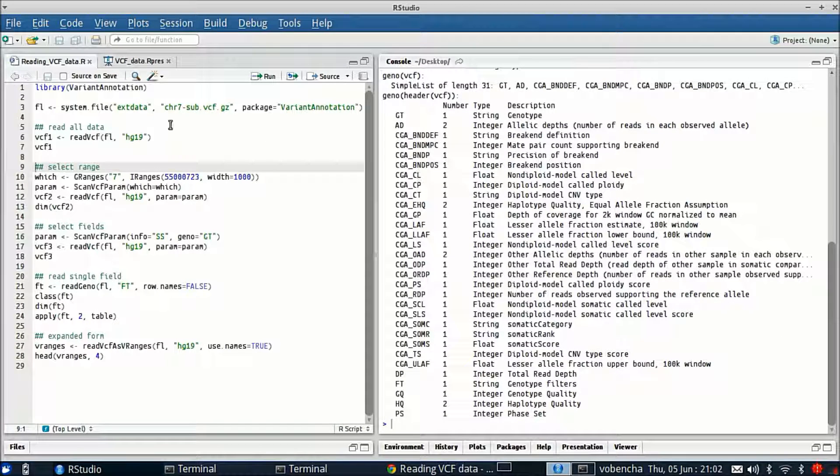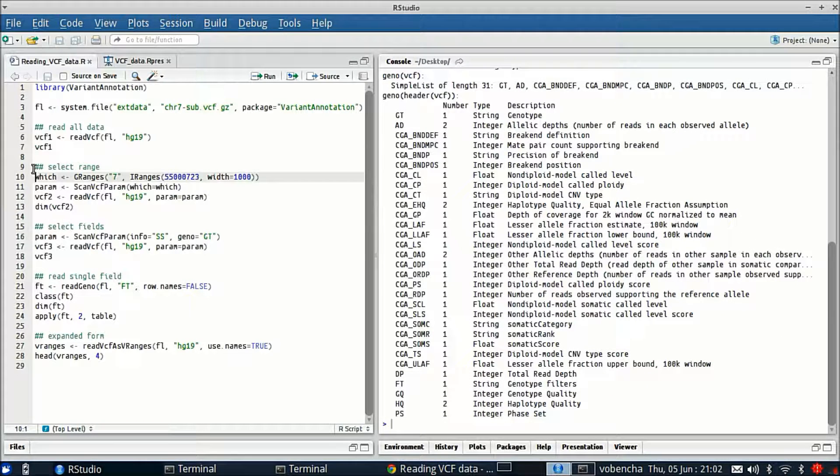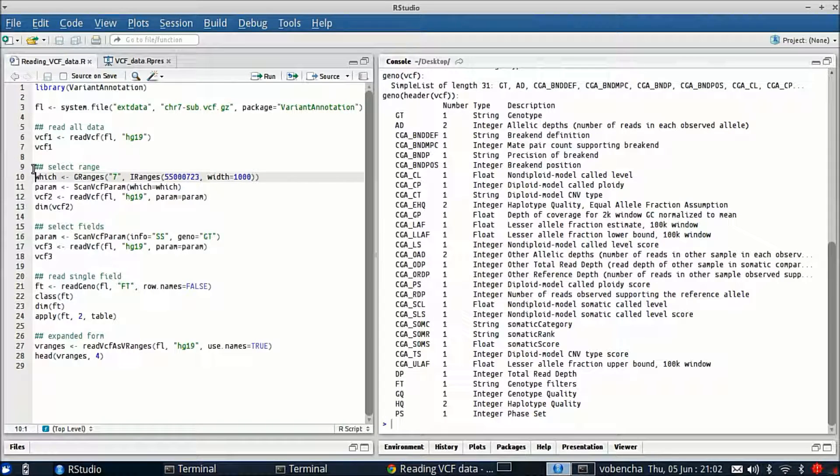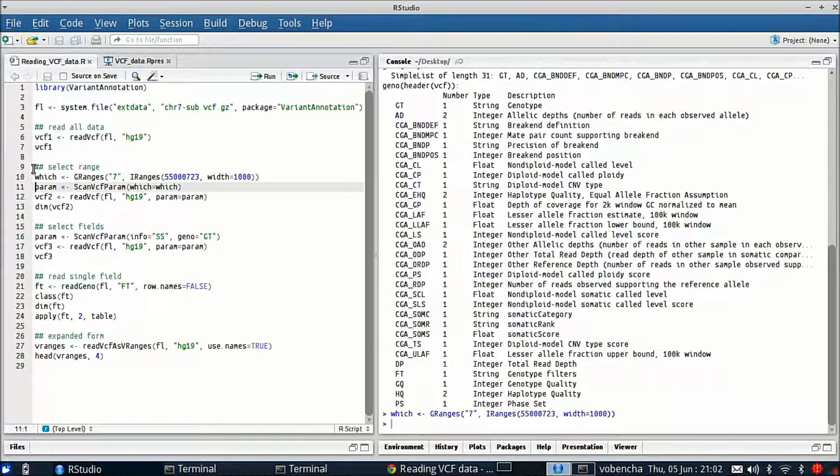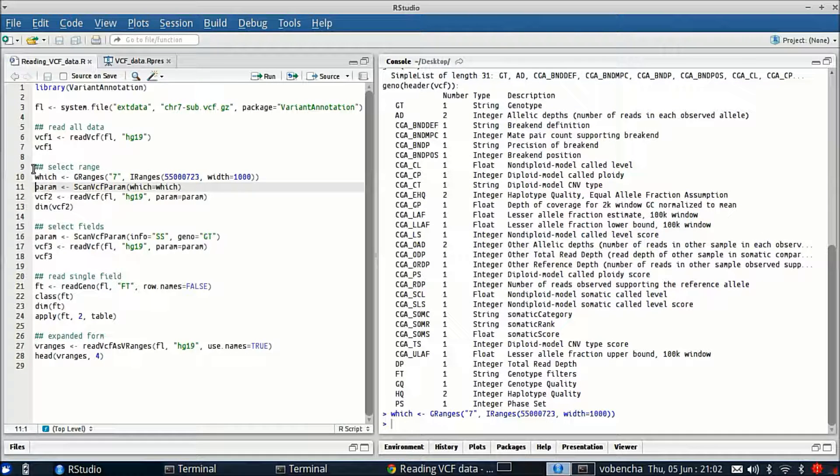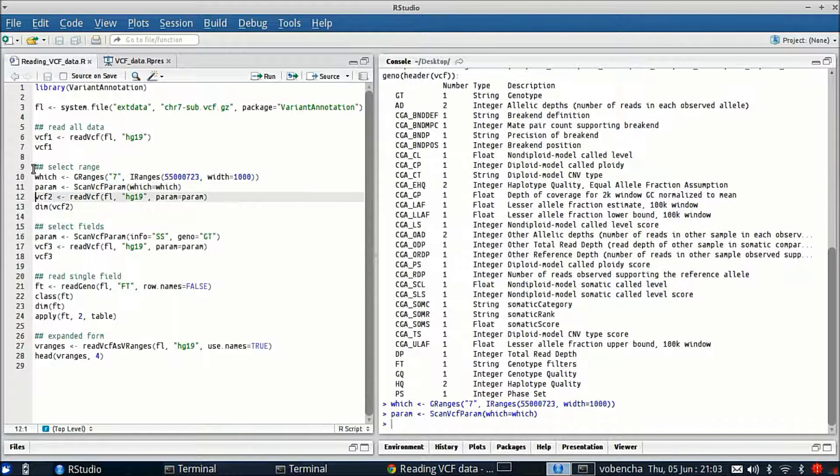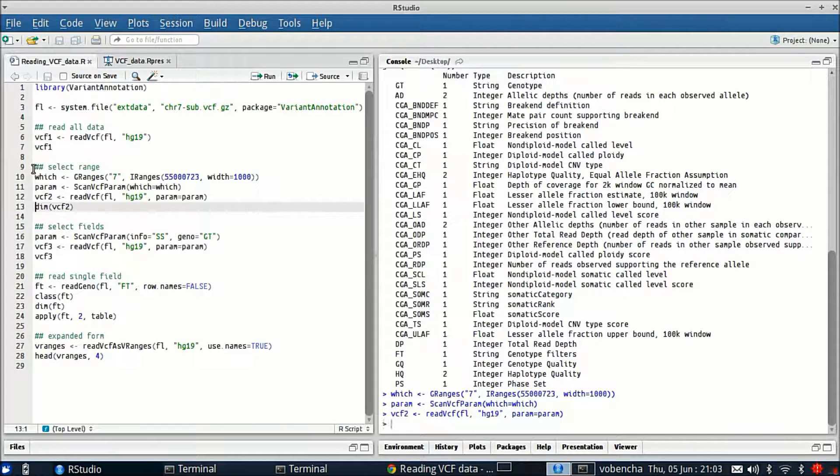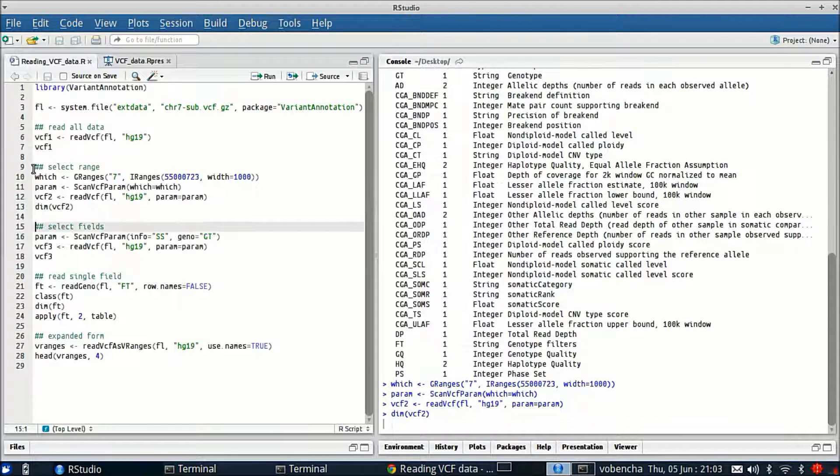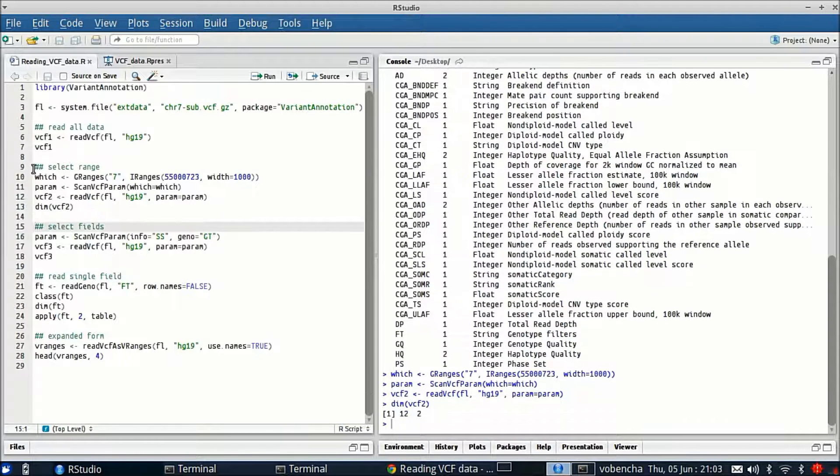Now I want to show you just reading in a particular range. If you know a range of variants that you're interested in, you can create this scanVCFparam and give that to ReadVCF and that will bring in only the variants in that range.